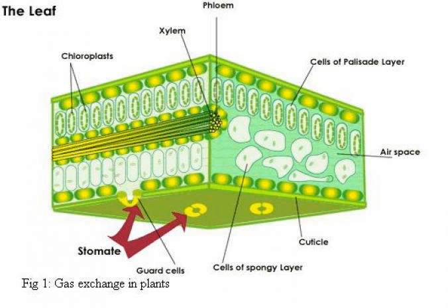8. Make a drawing of the top and bottom view of each leaf surface. Be sure to label each drawing accurately. 9. Calculate the area of the field of view in millimeters. Then calculate the stomata density using the formula stomatal density equals the number of stomata divided by the area. 10. Clean up your lab station, clean all slides, and turn off the microscope.